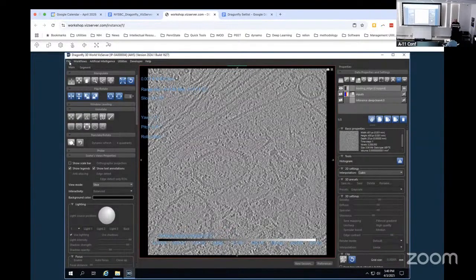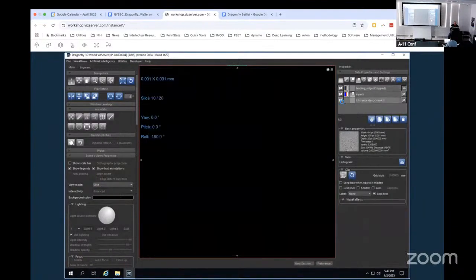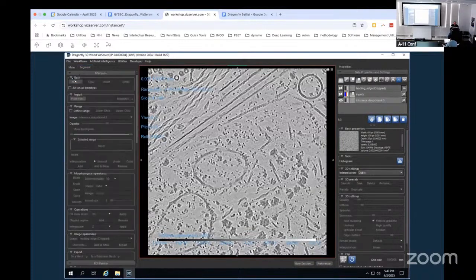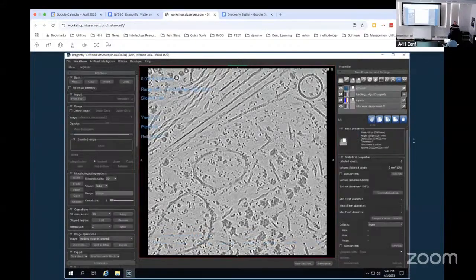I do want to show you how to manually paint things, but to be honest, I have saved training data so that we don't have to manually do all of this. But I didn't want you to go home without doing it once. Let's see. Go back here. I'm going to make a multi-ROI under the ground. Oh, wrong.